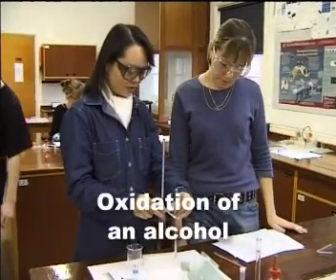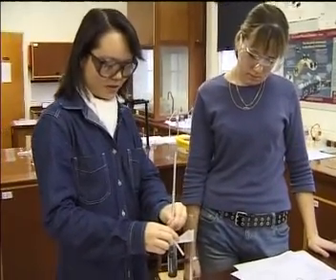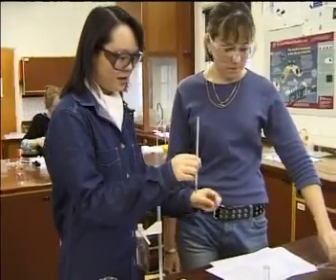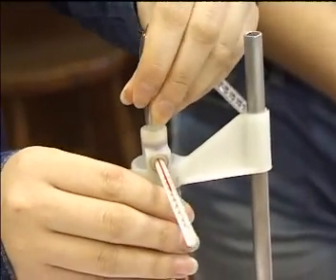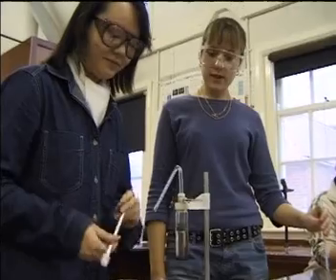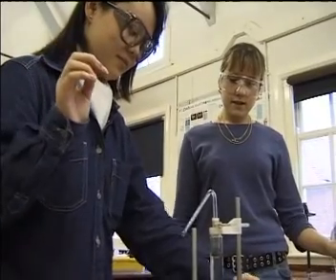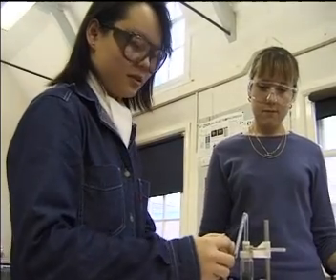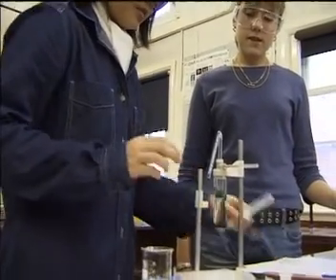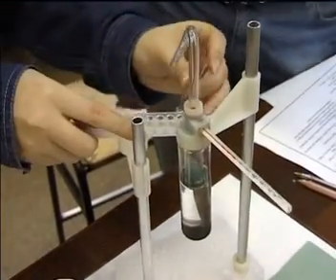Yeah, well, you just move the sauce and then let it cool down a bit. Then you just change the refluxing column. Do you got the distillation? This one? Yeah, that's it. Just switch over and put it here. You're trying to collect it, put it here, and put it there. And when you're trying to reflux it again, collect it. And then, have you got the column things? Yeah, one is here.